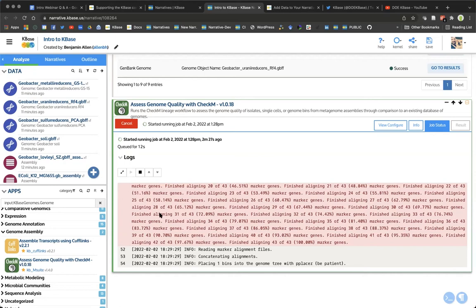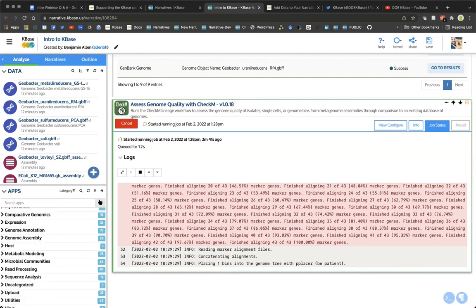So we're running this app. This will take not too long. As you can see, it was already finishing. So once this finishes, we'll look at the result. But I just want to talk about some of the exciting apps that we have on the system. Like I said, CheckM is an extremely popular one.